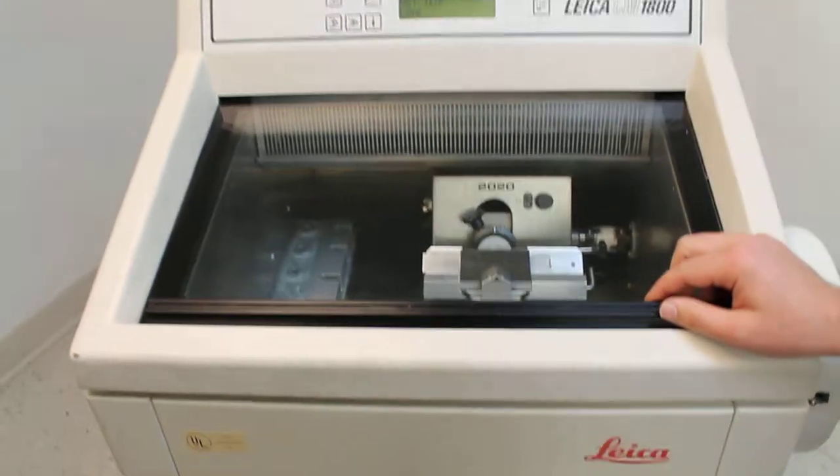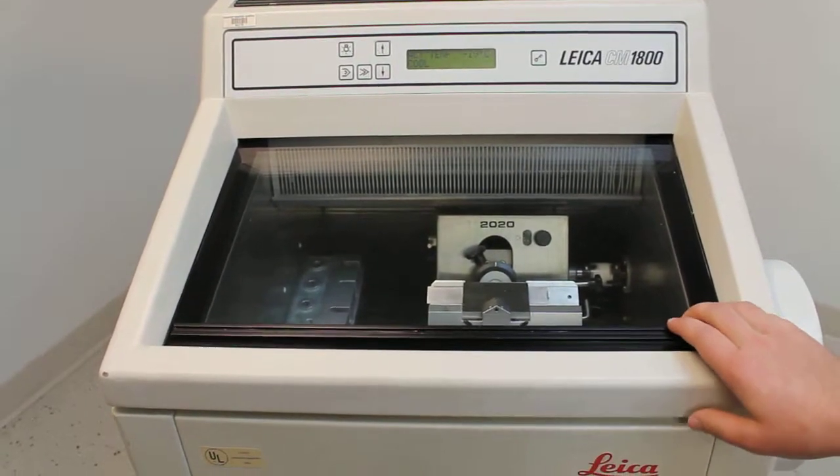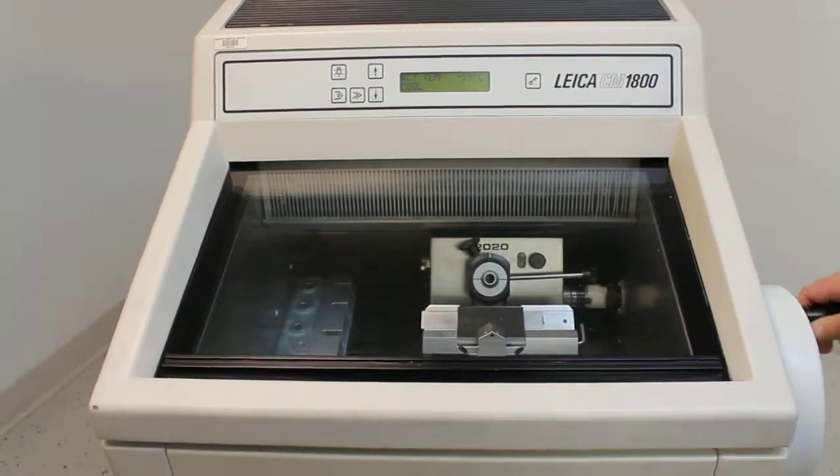So all in all, it's a very nice unit, fairly complete. One thing it is missing is chucks for the microtome head.